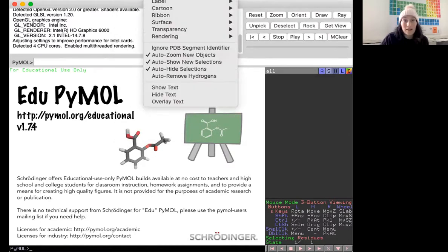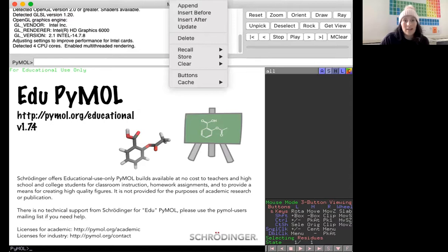That's pretty much the only thing I think you really use in settings. Sometimes, if you're looking, you can edit a lot. You can change a lot of little details like font sizes and font style, and that would be in the settings, edit all. Lots of options that you can tailor in Pymol. Scene, I don't really use.